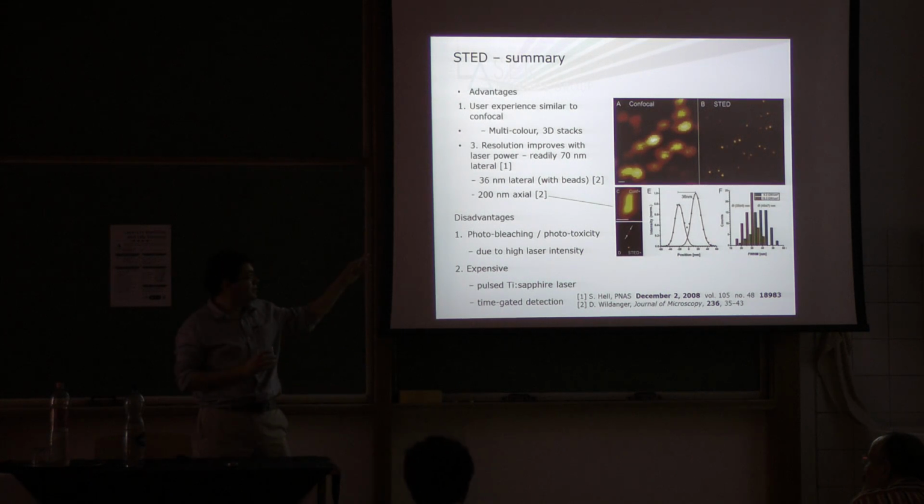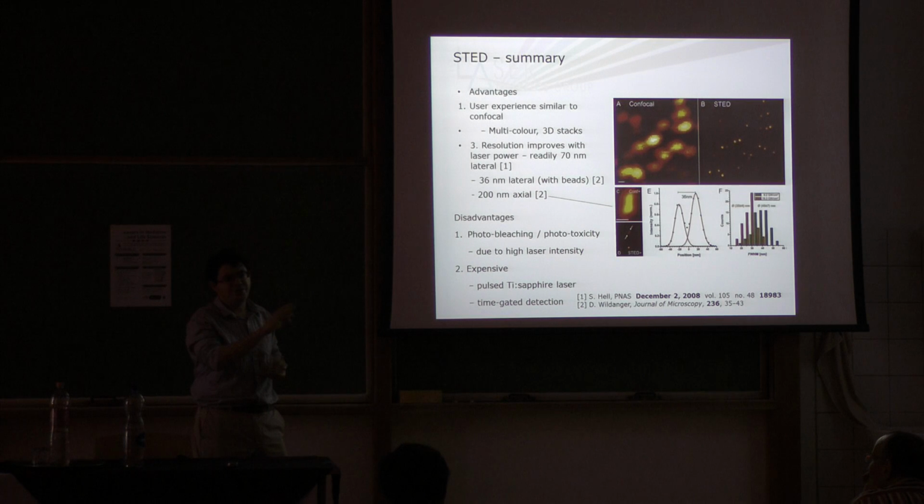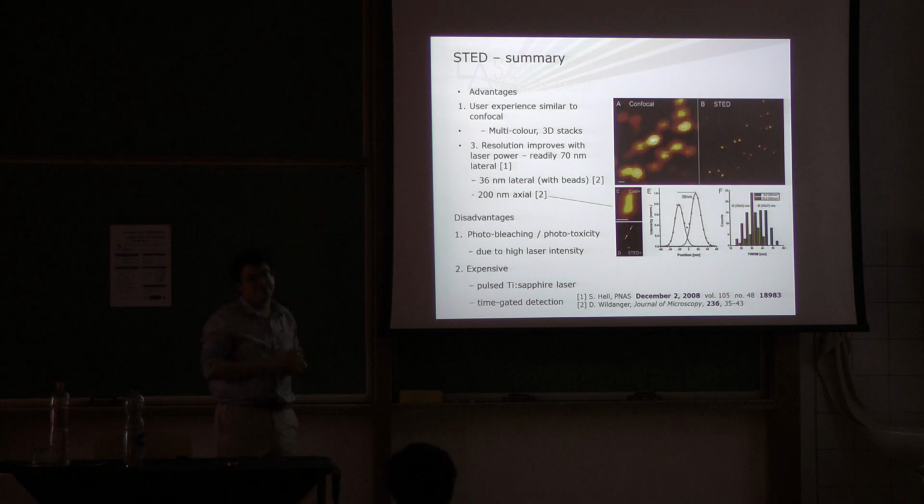Alternatively, if you have some beads and you know they're just points, you can iteratively adjust the XY position and the shape of your depletion beam to make sure that your STED image of what you know is beads comes out correctly centered and as bright as possible. The PhD student in the acknowledgements, I will point out, knows much more about this because he's the STED expert. But essentially, you have to get your alignment right before you start, probably before you start for the day with this technique.